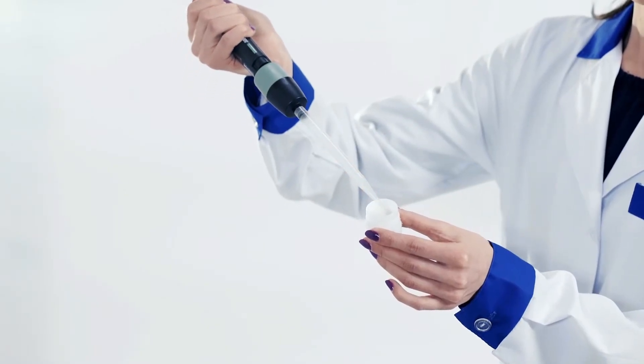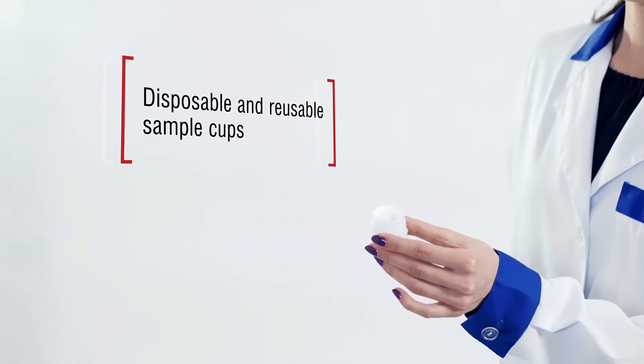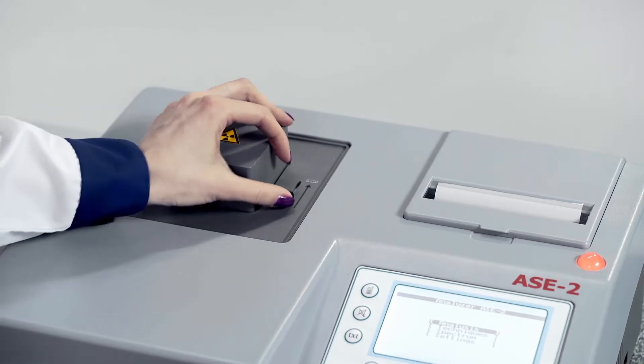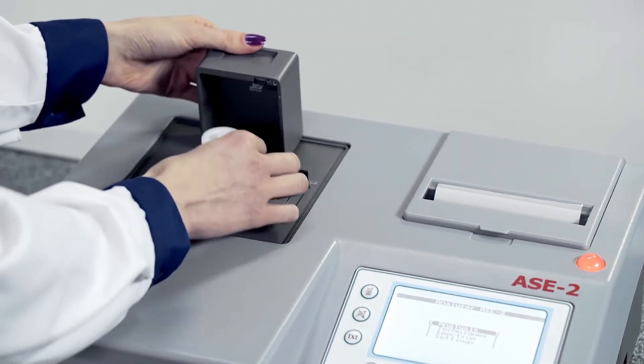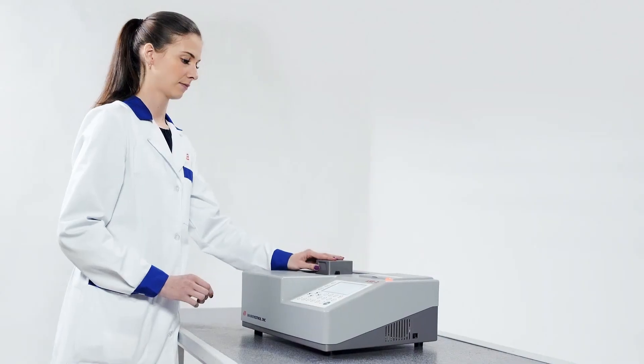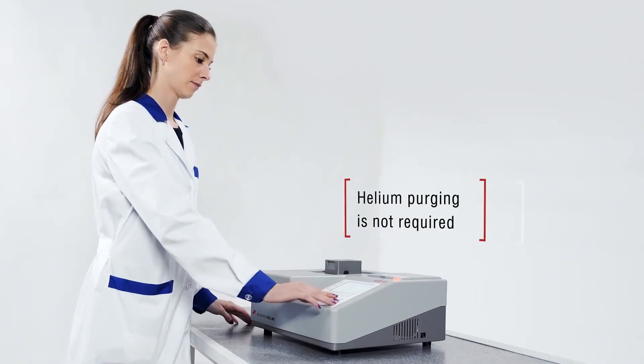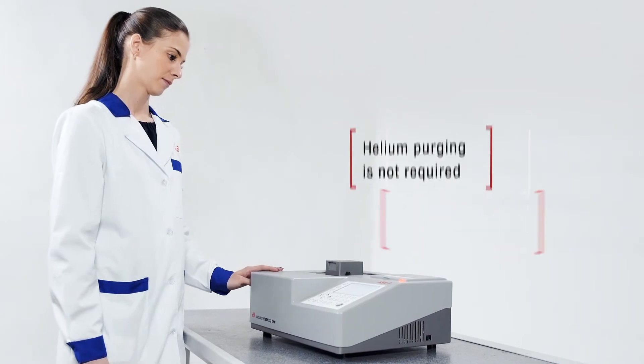The preparation procedure of sample cups takes just a few seconds. The sample cup is filled with the analyzed sample through its opening. Only a small amount of substance is required for analysis because the sample is located above the measuring chamber.